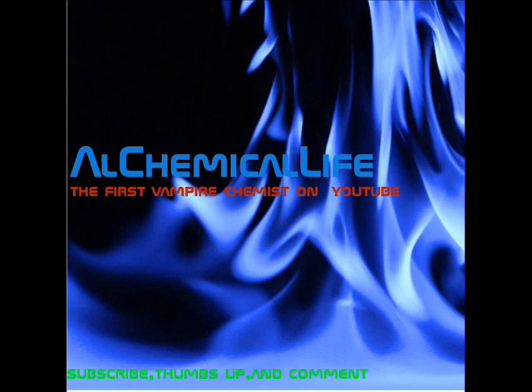Welcome to Life. We're going to be making hydrochloric acid from sodium bisulfate and sodium chloride. A word of warning: hydrochloric acid is toxic and corrosive, and sodium bisulfate is corrosive. Please do this outside in a fume hood and wear gloves and proper PPE whenever working with these chemicals.